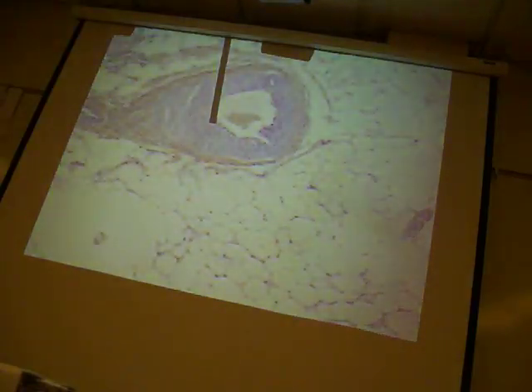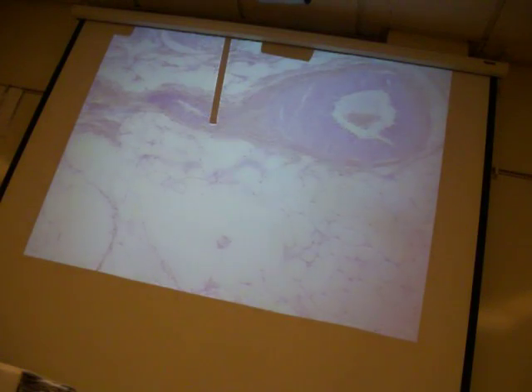I mean, we're looking at it on frog skin, but you can't really relate to that, right? So if we had a cross section through an alveoli, right, through lung tissue, we'll also find that simple squamous on there. Just to kind of show you guys a difference here.